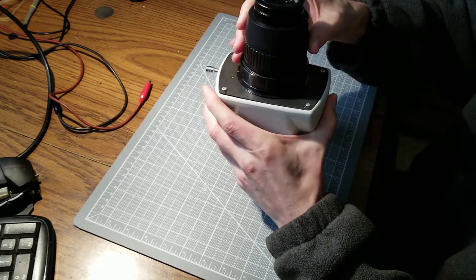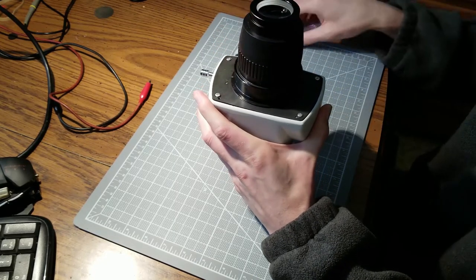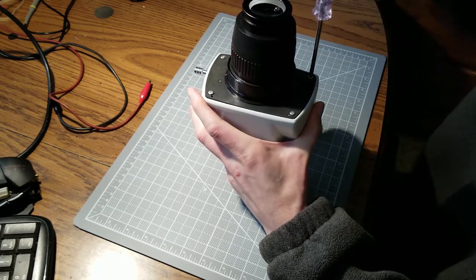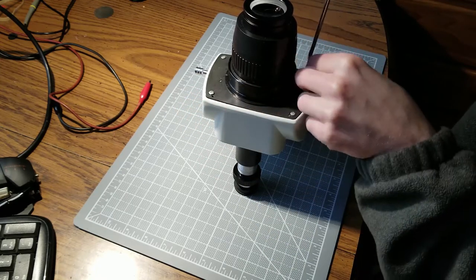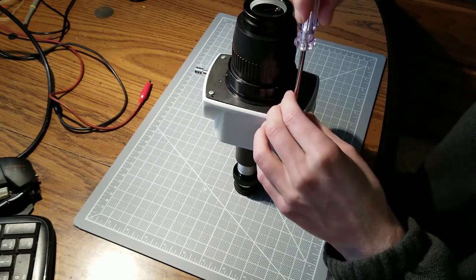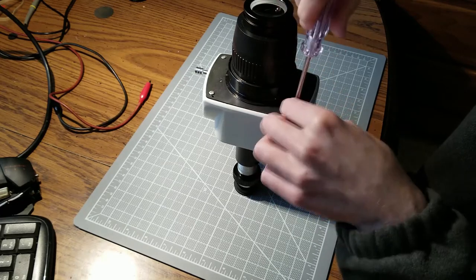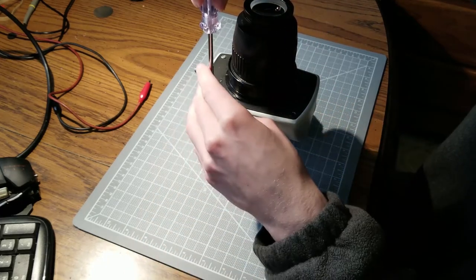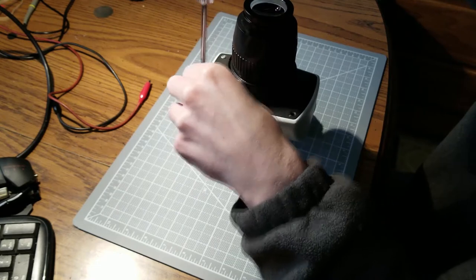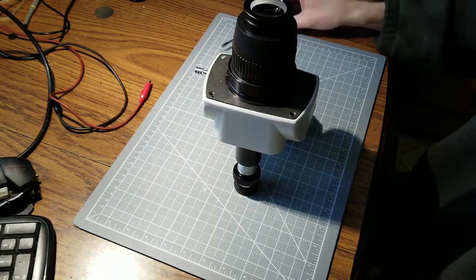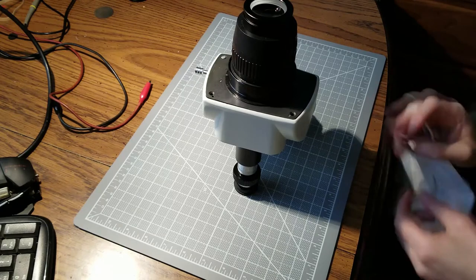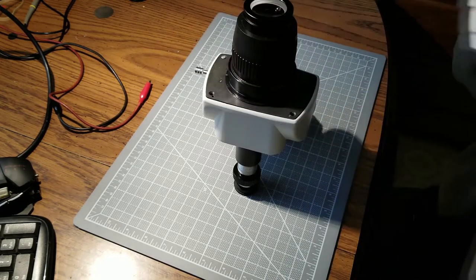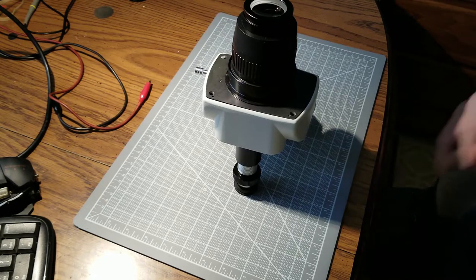It should be loose and should come apart pretty easily after you take the screws out. I'm putting on a mask here also just to try to prevent dust and other foreign matter from getting inside of this.